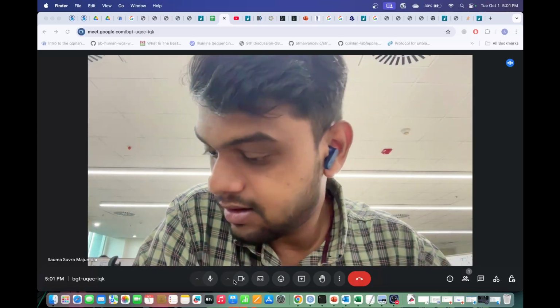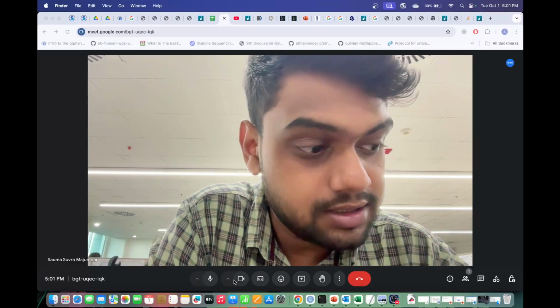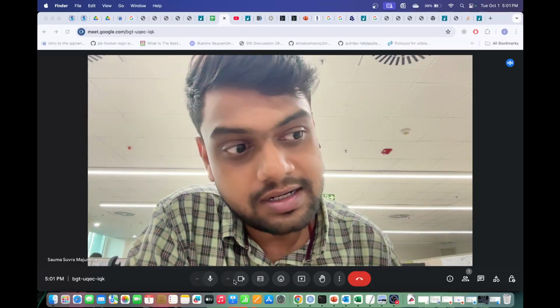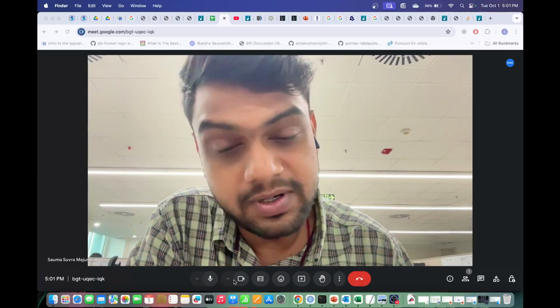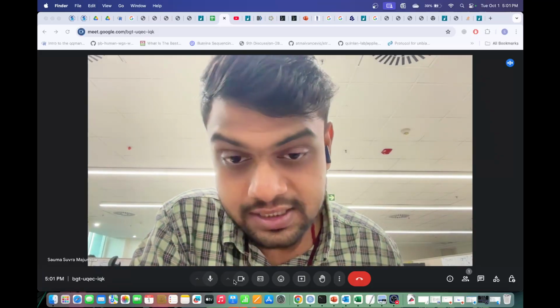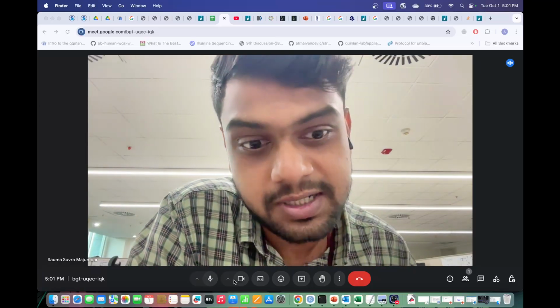So hello everyone. Welcome to week 10 of NGS data analysis and applications. In the last weeks, we learned about RNA sequencing data and how we pre-process the data, how we align the data, then do differential expression analysis with different types of models, and ultimately functional enrichment analysis.